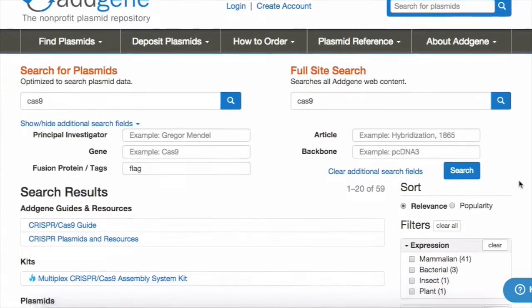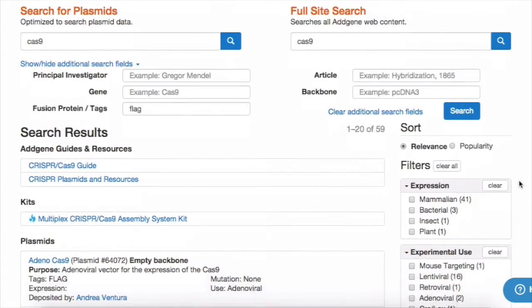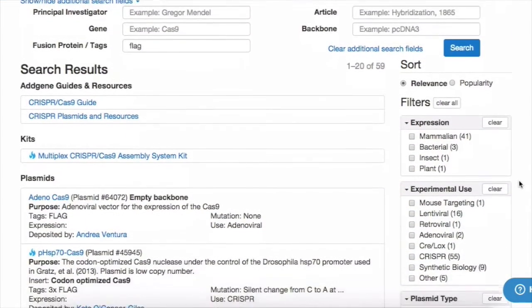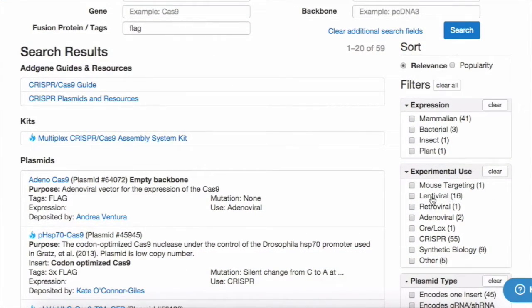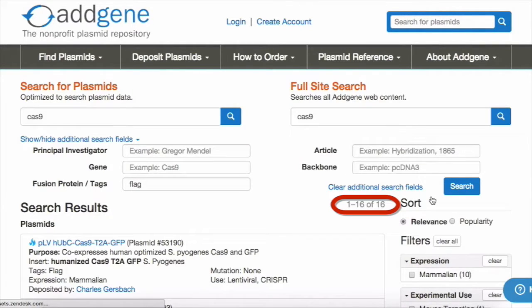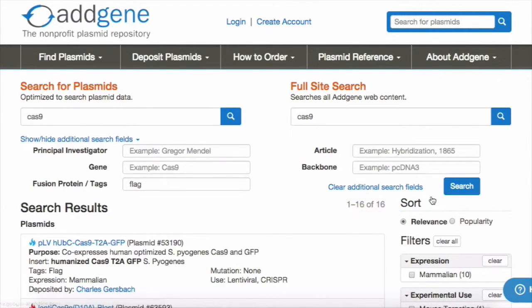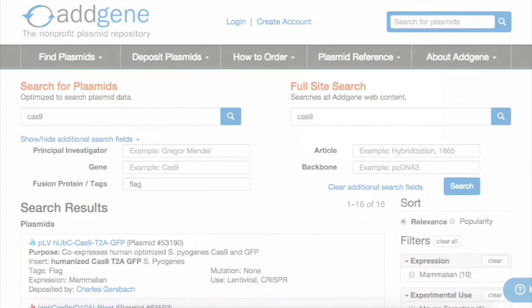Getting closer! Since we only want lentiviral Cas9 plasmids for this search, we can check off lentiviral under the experimental use filter section on the right side of the browser. As you can see, by searching using keywords and filters, you can find results that match your specific criteria.